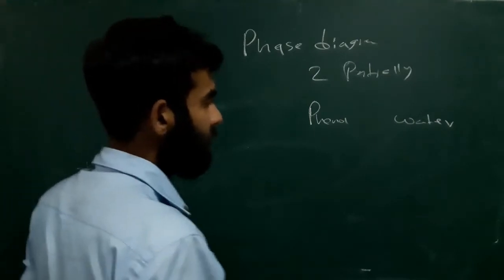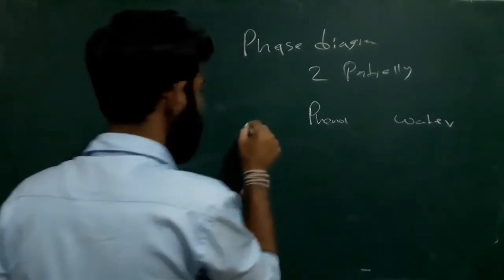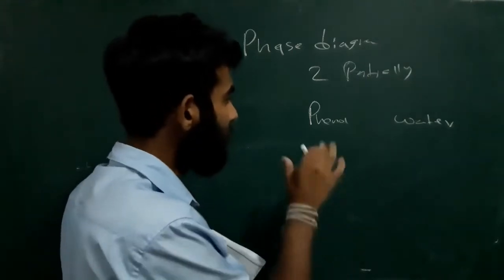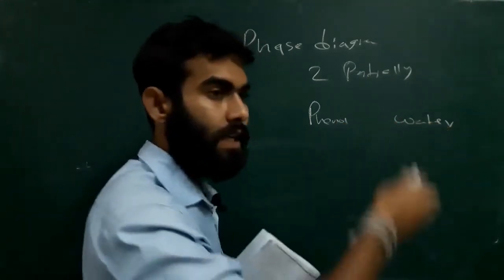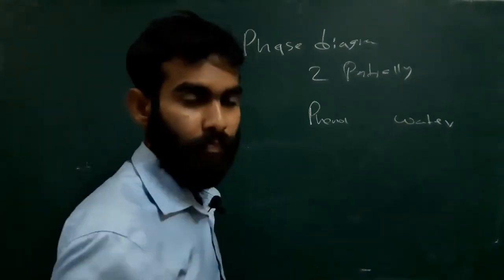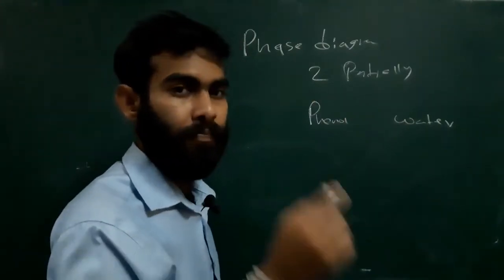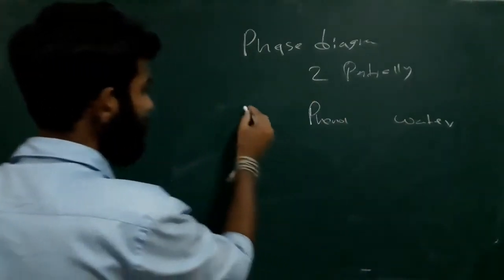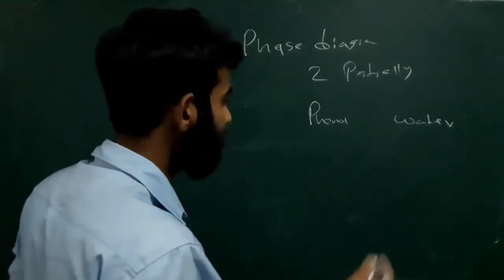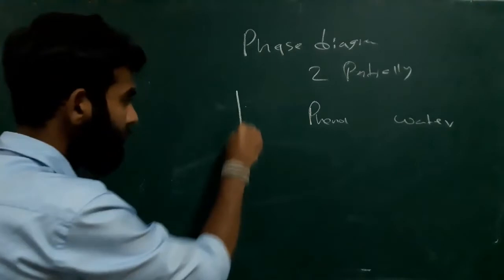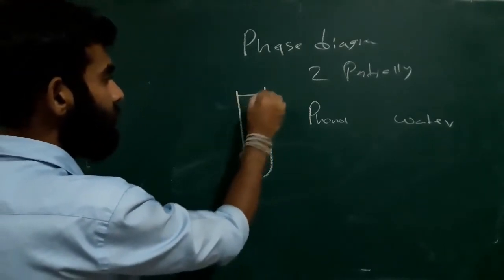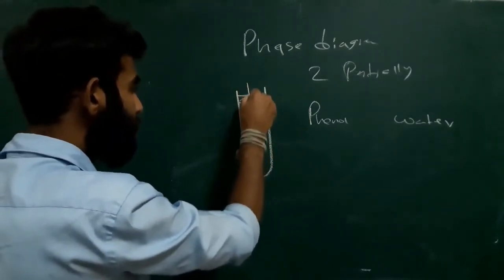In room temperature, they appear as two phases. If we shake both solutions in a boiling tube, we will see turbidity. We are going to get the phase diagram. To do that, we will get a boiling tube and stopper, and we will insert a thermometer.